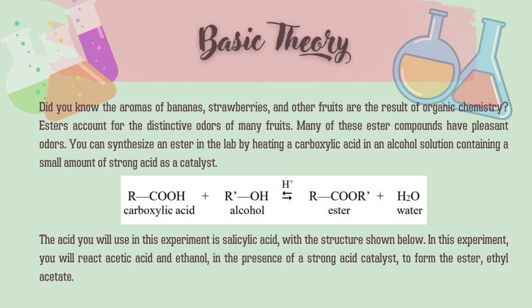The acid that we use in this experiment is salicylic acid, and in this experiment we will react acetic acid and ethanol in the presence of a strong acid catalyst to form the ester ethyl acetate.